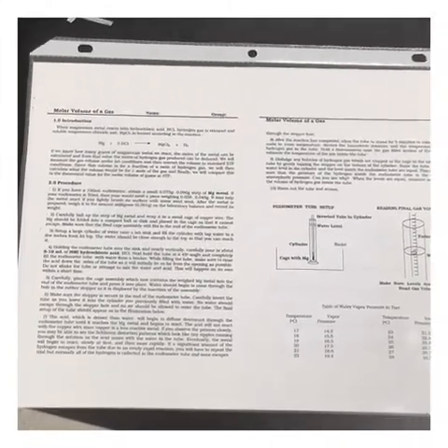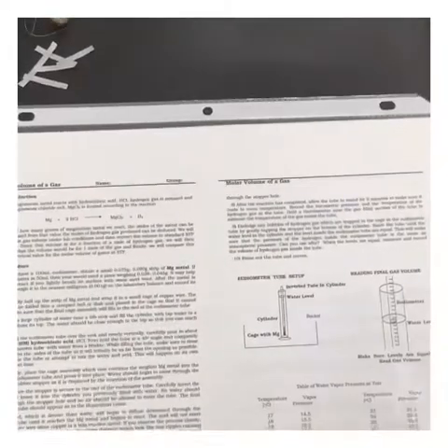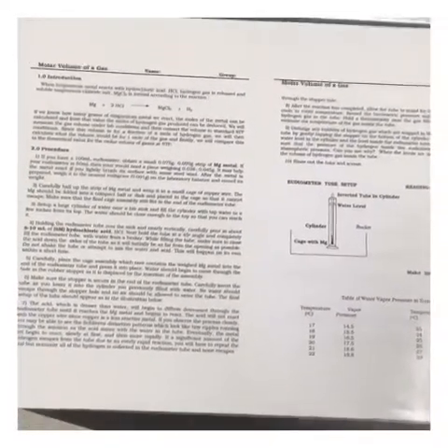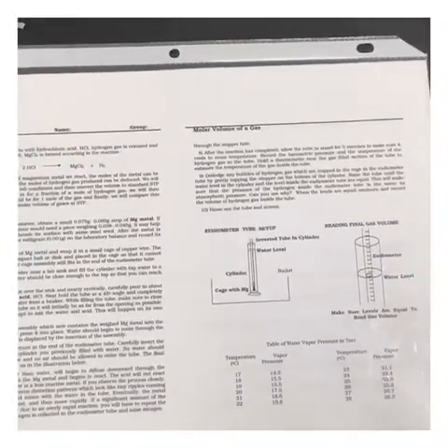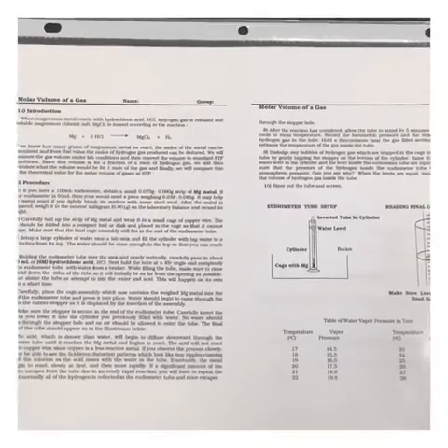All right, guys, today we are doing another lab. Today we are going to be working on this guy right here. We are going to be finding the molar volume of a gas. We are now experts at gas laws. We took a test on it and we're ready to prove how good we are with our gas laws.